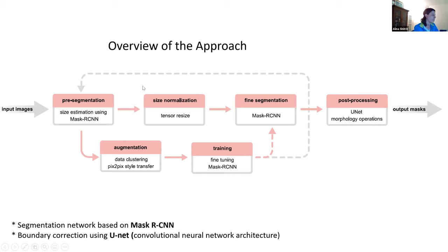But the big novelty here in the paper is the data augmentation using synthetic images, when they use the style transfer to do that.